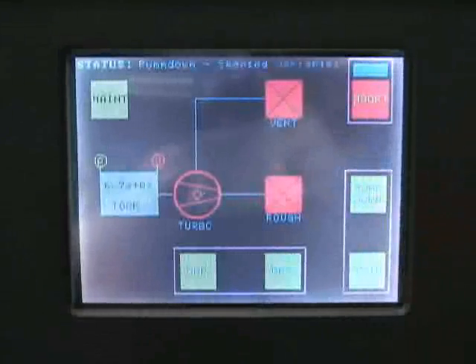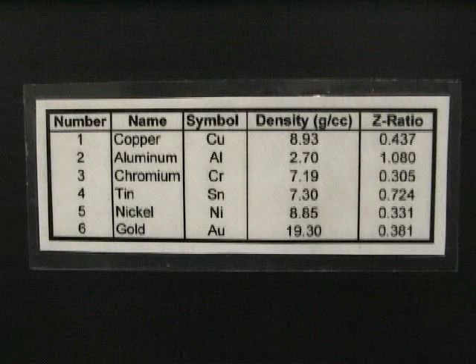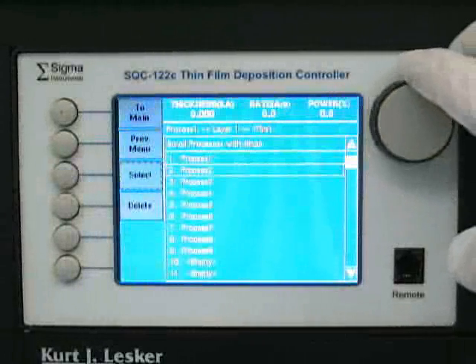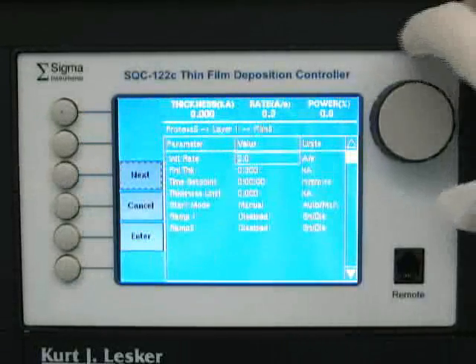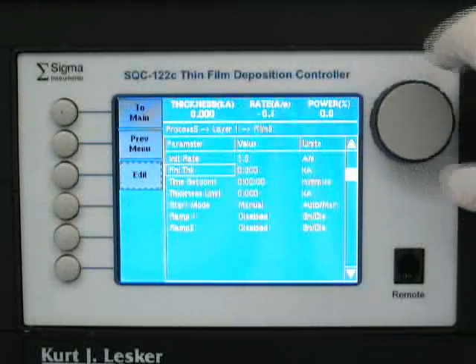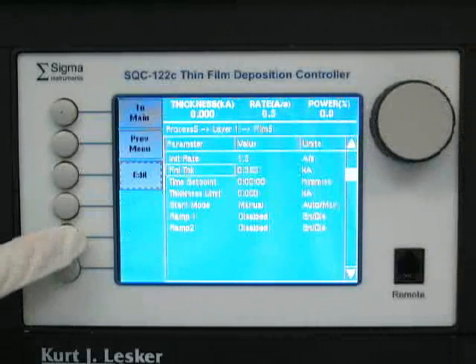The chamber pressure will be indicated in Torr on the left side of the screen. To set up your deposition, use the chart posted on the control panel as a reference when choosing the metal you are depositing. This chart will show you which process and film to select for proper deposition. Select the process you would like to run by pressing the process menu button on the deposition monitor. You should verify that the proper film is set in the process menu. If you wish to edit any aspects of your process, you can do so through the process menu button. After selecting the appropriate recipe, press the edit button until you get to process parameters, which allows you to set the deposition rate and the final desired film thickness.